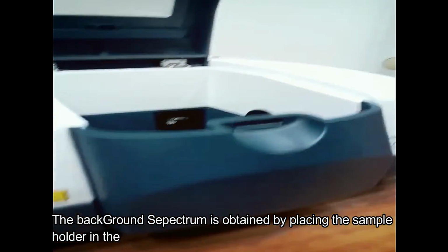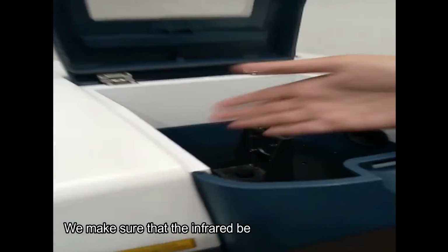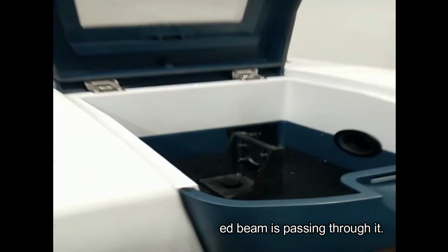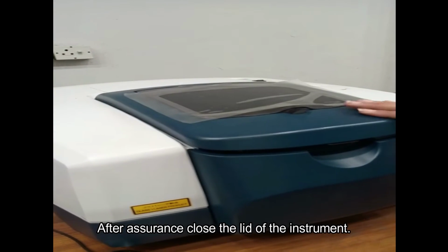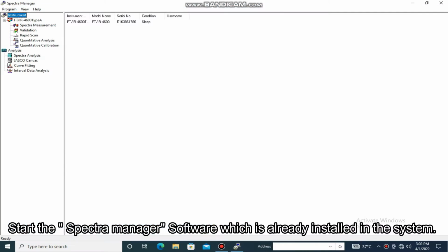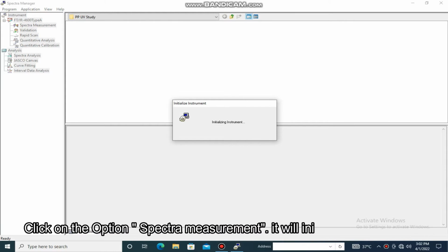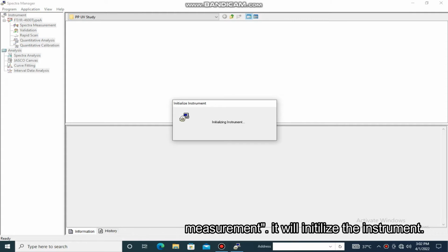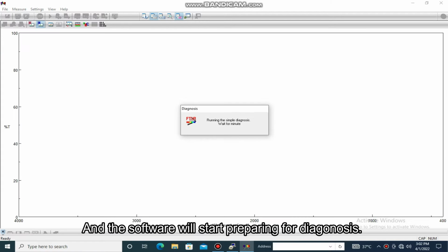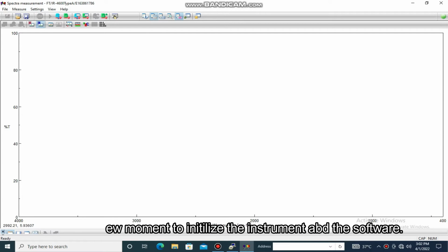The background spectrum is obtained by placing the sample holder in the instrument. We ensure that the infrared beam is passing through it. After ensuring this, close the lid of the instrument. Start the Spectra Manager software, which is already installed in the system. Click on the option Spectra Measurement. It will initialize the instrument and the software will start preparing for diagnosis. It will take a few moments to initialize.